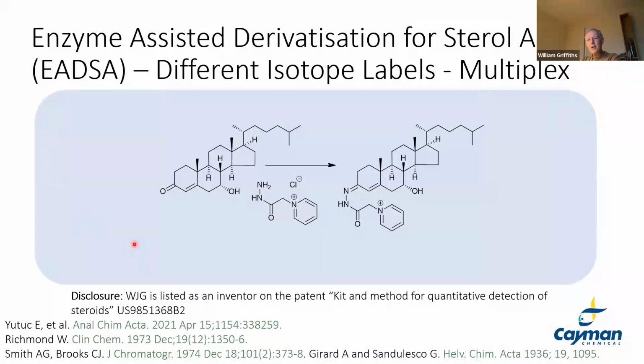I guess there are always complications with derivatization. Some oxysterols naturally possess a 3-oxo-4-ene group. If we're interested in those that naturally possess a 3-oxo-4-ene group, then we don't need to bother with the enzyme at the beginning. So we can skip the cholesterol oxidase. And when we're interested in these molecules, the Girard reagent that we use is the D0 Girard reagent. None of those deuteriums are present.